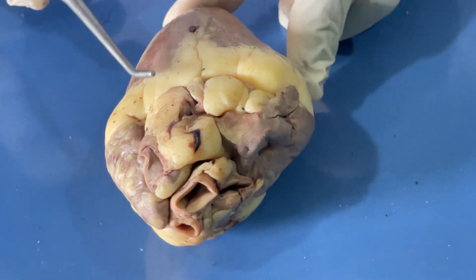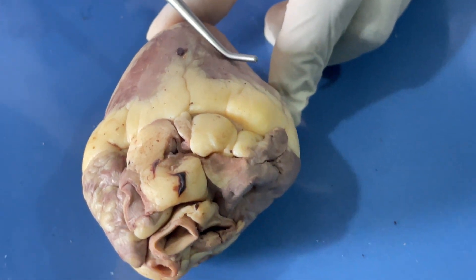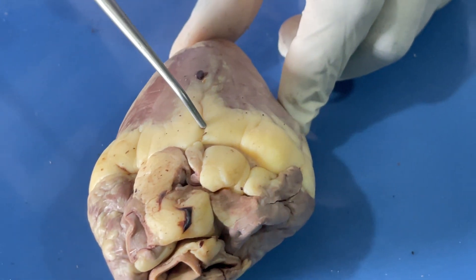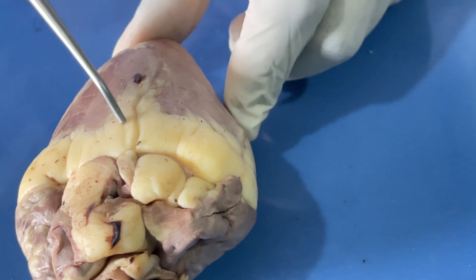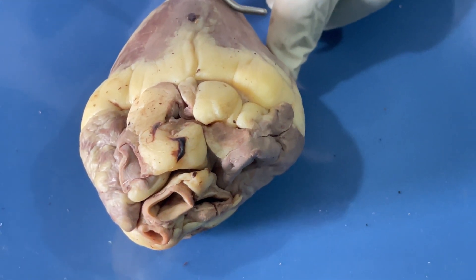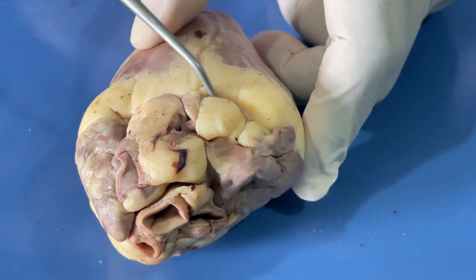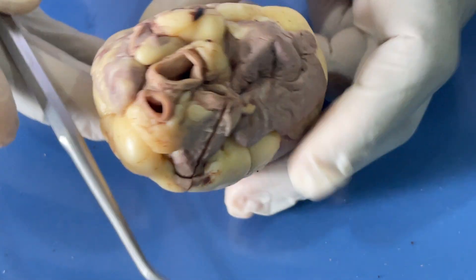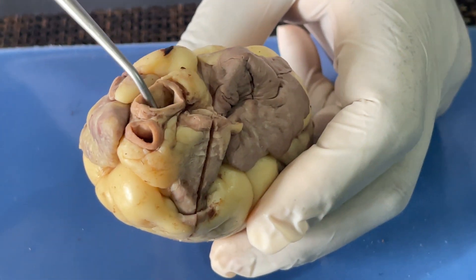Now we can turn it posteriorly. Remember that the left has now become the right and the right has become the left. We can also observe this sulcus, which is the posterior interventricular sulcus, and that separates the left side of the ventricle from the right ventricle. Then we can also observe the coronary sulcus here.